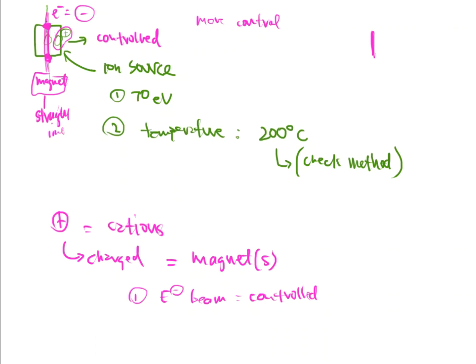So embedded into this system, think of it almost as another magnet. And I'm just going to draw it over here to the side. And I'm just going to put magnet number 2 maybe. And another magnet is going to be present to repel, it pushes away those positively charged species. All right, well, that probably means that this magnet has to be positive.